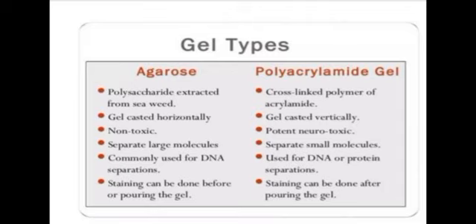Next, we see the types of gel, agarose and polyacrylamide gel. First, we see agarose. Agarose is a polysaccharide extracted from seaweeds. The gel is cast horizontally. This agarose gel is non-toxic and it separates large molecules, commonly used for DNA separation. Agarose staining can be done before pouring the gel.